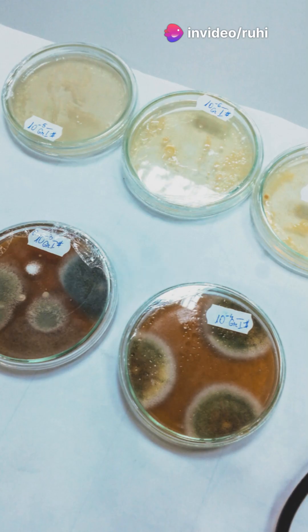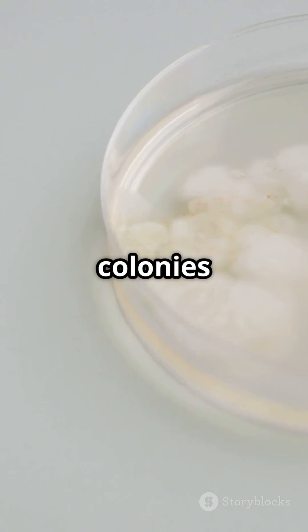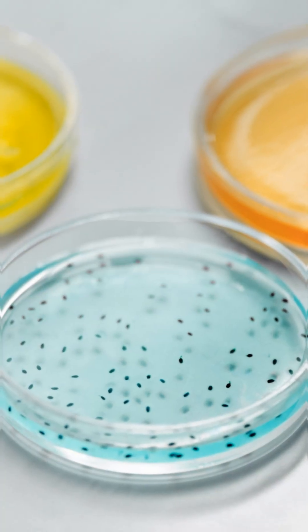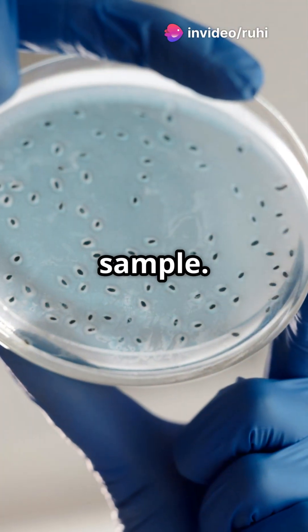And voila! Within 24 to 48 hours, you'll see distinct bacterial colonies grow. Each colony represents a different type of bacteria from your soil sample.